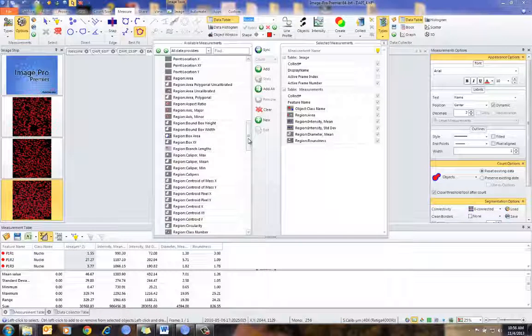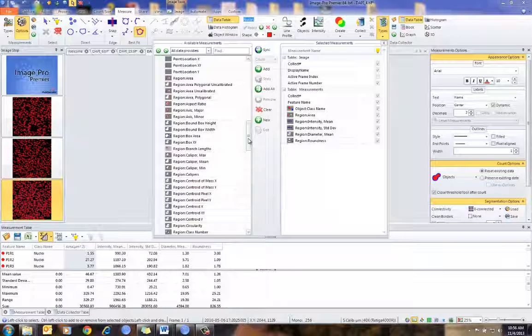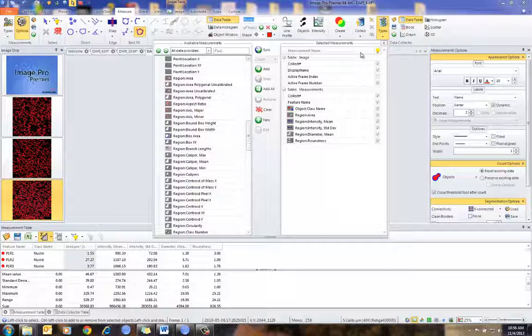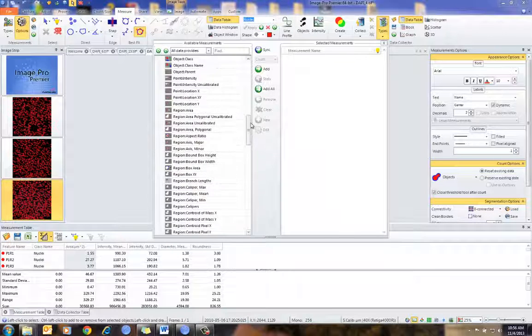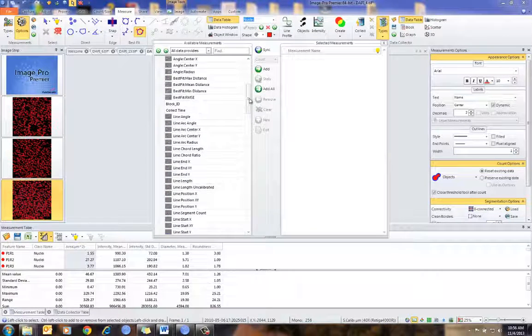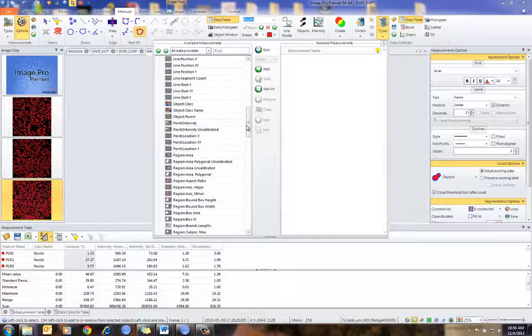— maybe you want the mean of all the diameters or the mean intensity of all the objects. Instead of accumulating the raw data, if you have thousands of cells or objects or nuclei per image and you only want one line of data per image, you can easily set that up now. By clearing this out, you can go into Data Collector by choosing the measurement statistics and select the parameters of interest.